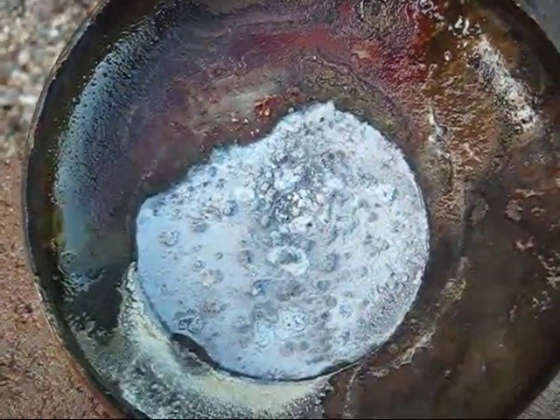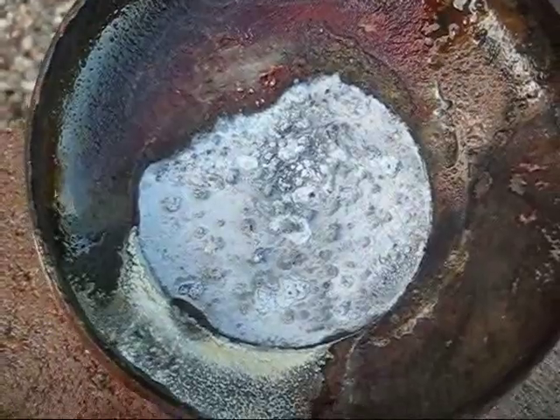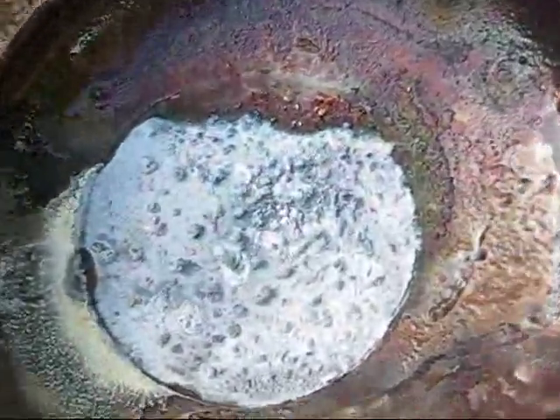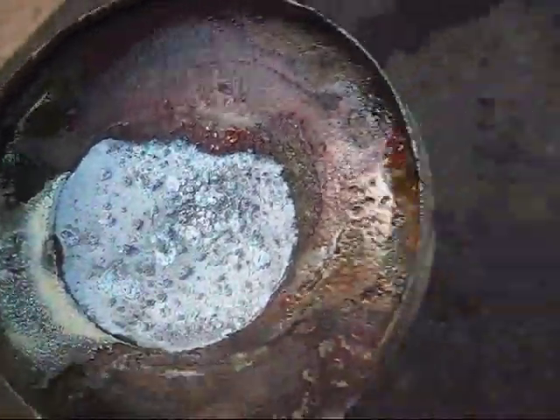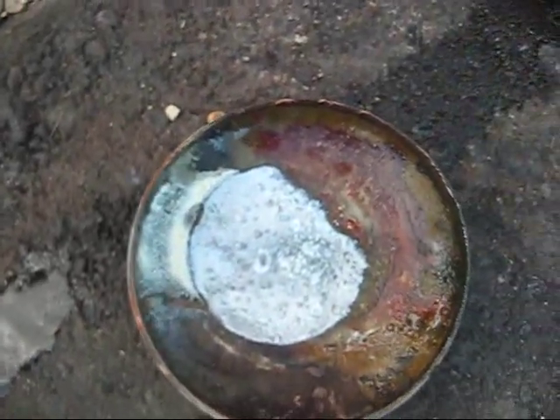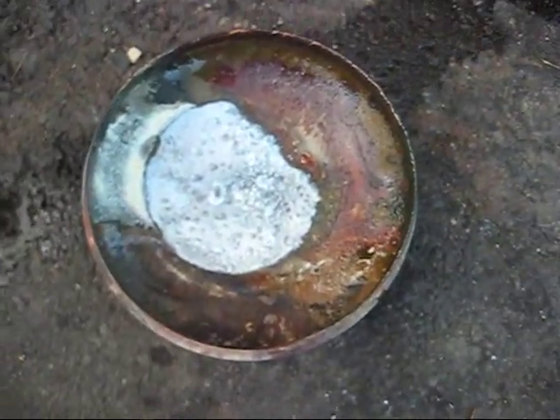Here you can see the lid that covered the reaction — it's actually covered in quite a bit of sodium itself. Let me see if I can pick this lid up and put it down over here, and just put a little water in there.